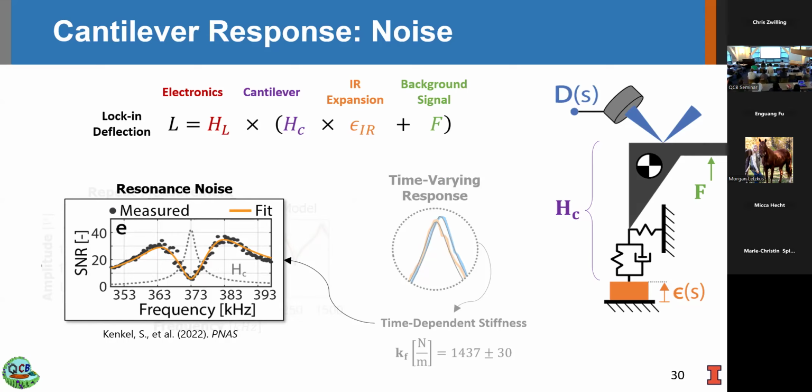Here we find that rapid fluctuations in this stiffness can introduce noise that exceeds the sensitivity benefits expected at resonance. So this dotted line shows the resonant curve. That's what you'd expect for sensitivity, which should scale with the signal to noise ratio. However, the true signal to noise ratio actually dips near resonance with conventional AFMIR, because noise actually scales much worse than the actual sensitivity benefits.